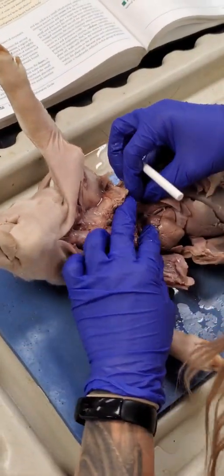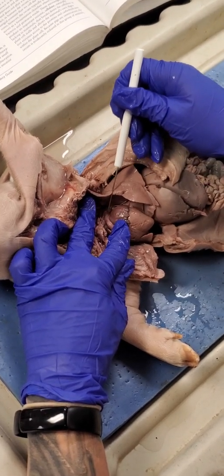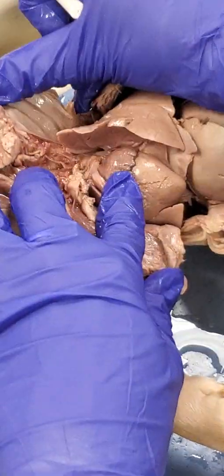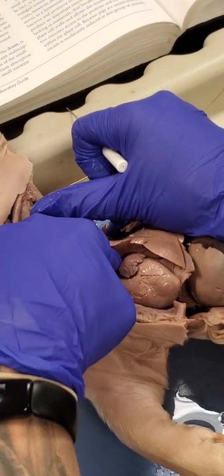And let's see. Okay, you guys see it right here? This thing right there. Big old tube. Can you slightly turn it? There we go. Oh, okay, that one right there. Yep. So see it coming right from here, from the ventricle.